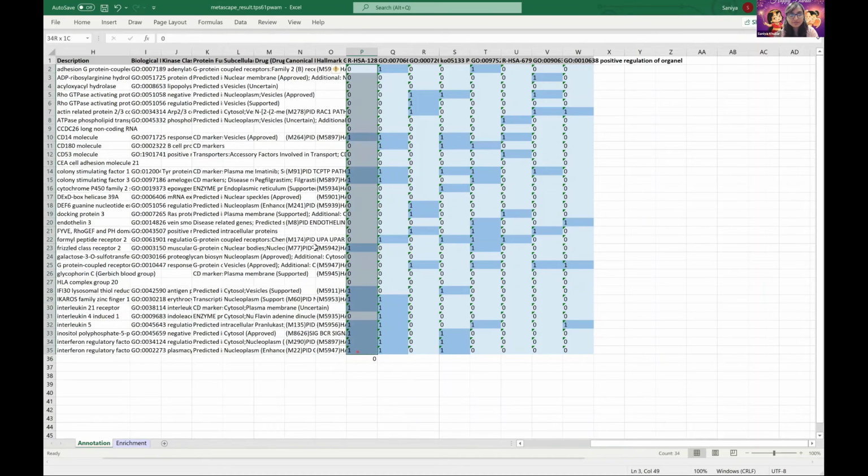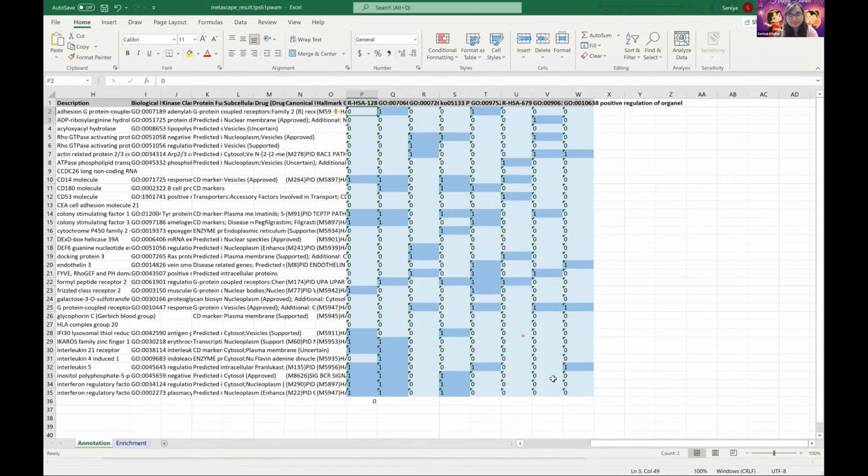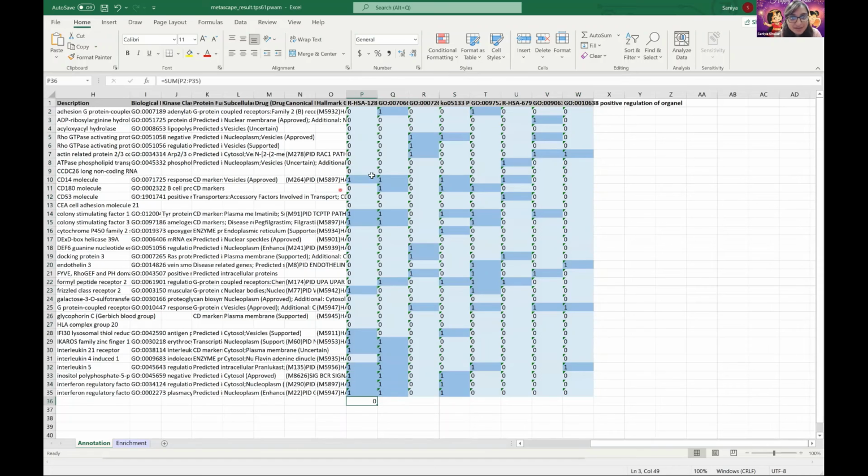Okay, I think maybe we have to convert these to numbers, because these are general types. So let's convert these to numbers. Okay, anyways, let's count them. 1, 2, 3, 4, 5, 6, 7, 8, 9, 10, 11 for this one. Okay, so I think there's a little bit higher.